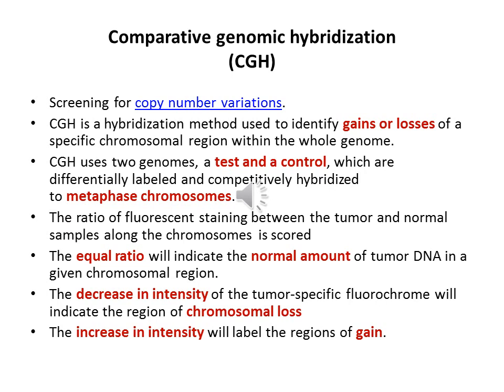The green to red fluorescence ratio measured along the chromosomal axis represents loss or gain of the genetic material in the impaired cell at that specific locus, and it can be analyzed by a computer. A higher intensity of the test sample color in a specific region of chromosome indicates the gain of material of that region in the source sample, while a higher intensity of the reference sample color indicates the loss of material. A yellow or neutral color indicates no difference between the samples in that location.